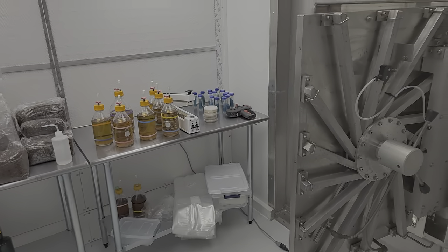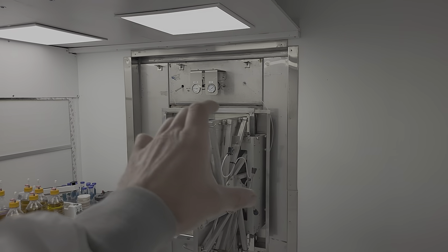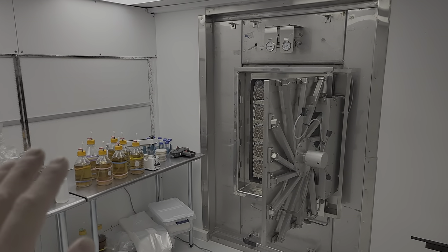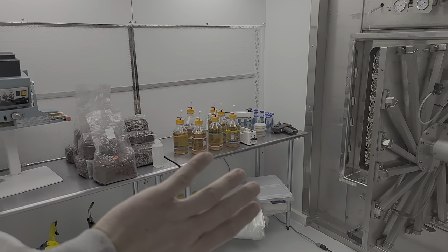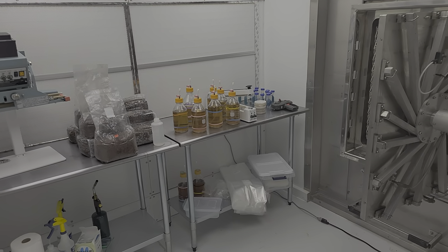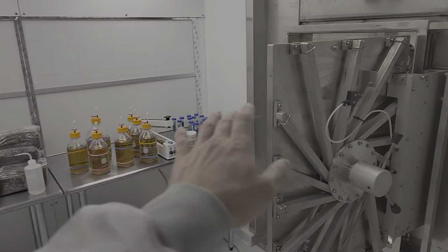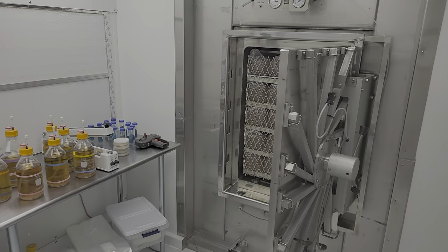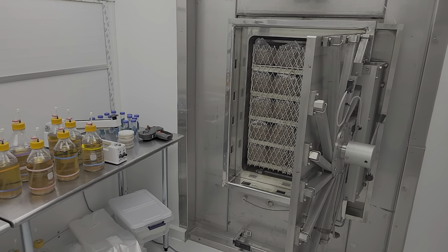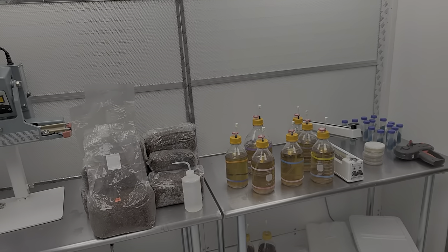The autoclave is positioned in the airflow — flow hood air comes out and goes up to the return, creating a full unidirectional flow in here. I'm standing eight feet away from the flow hoods and I can absolutely feel the draft on my hand — about 80 to 100 feet per minute. This makes it so the whole area is enveloped in a clean air envelope, which is very important when making consistent spawn.